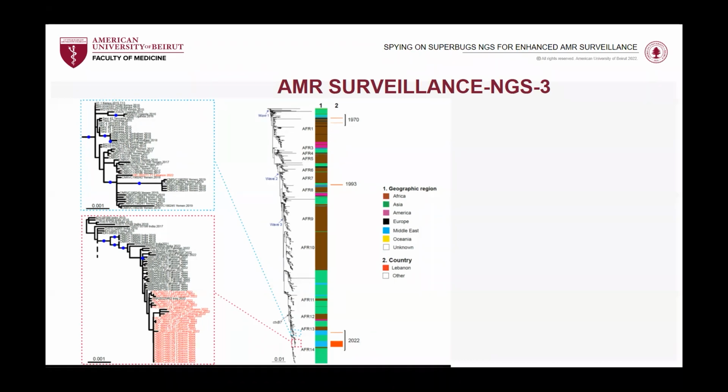And then we started sequencing the strains that we are getting. We discovered that the cholera strain in Lebanon belongs to the genomic wave 3 of sequence type 69, which is brilliant. And then it clusters with the strains that come from Pakistan, from Iraq, Afghanistan, and from Syria. And there is no surprise, because if we go back in time a bit, the cholera outbreak actually started in May 2022 in Karachi. Karachi was swamped.